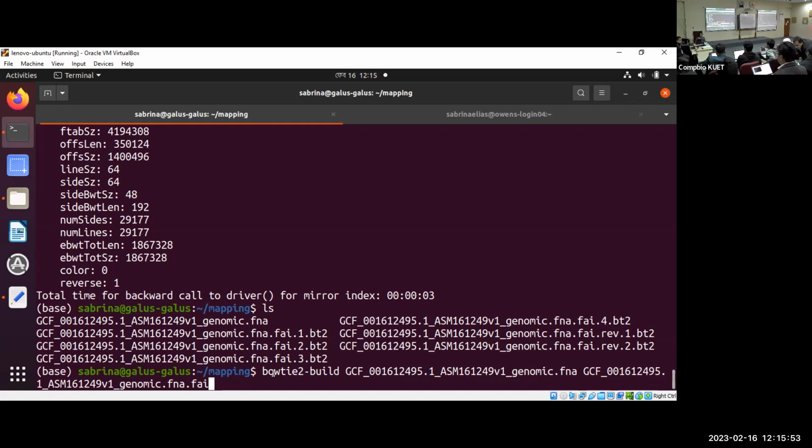If you have the file in GZ format, it's okay if you unzip it. You do not need to unzip the first one, but the reference is better unzipped. Have you unzipped it? Okay, you can try this after unzipping. For unzipping, the command is gunzip, then the file name something.gz. If it ends with .gz, you can unzip it with this command.